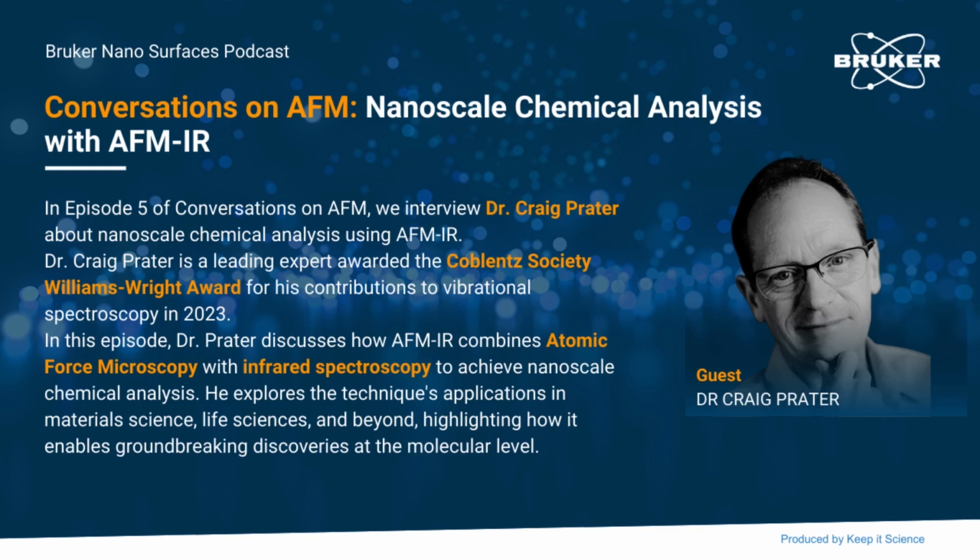So then my colleagues, Roshan Shetty and Kevin Kohler, started working with a laser scientist, laser expert named Konstantin Vodopyanov. And together they put together a benchtop tunable laser that they coupled to an AFM for the first time. And that was what really enabled us to have a vision for a commercial product that would allow that very high spatial resolution and be an instrument that could be implemented in lots and lots of labs all over the world.